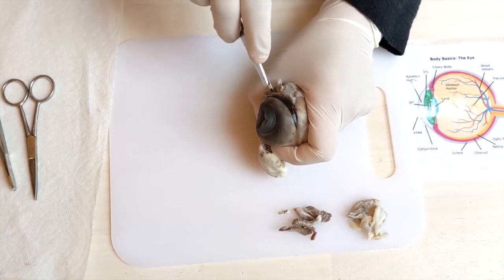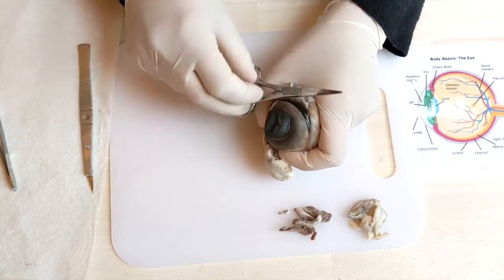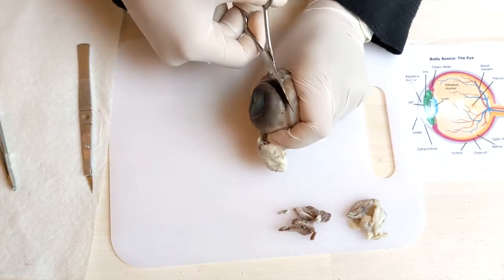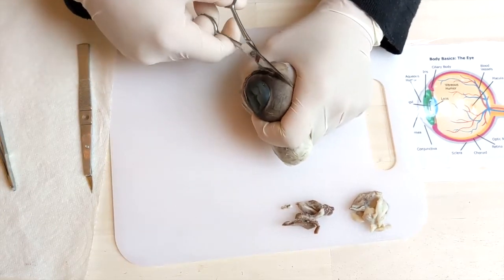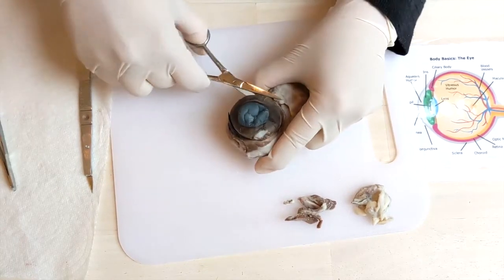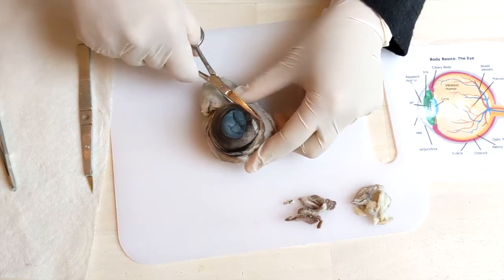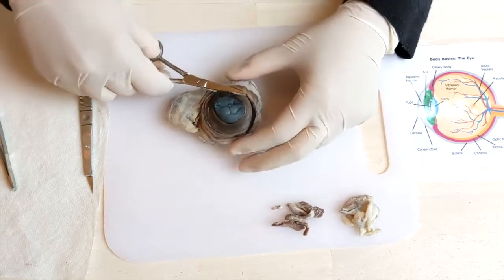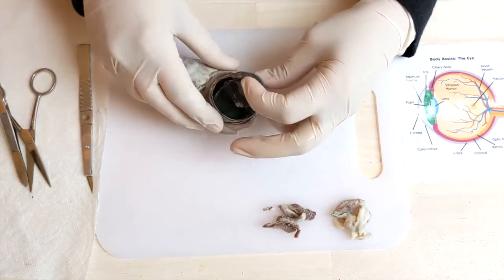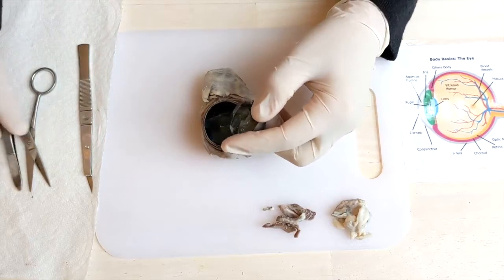What is that water squirting down? It looks like water. Maybe it's aqueous humor. We'll learn about that. So we'll put the scissors here, and then we're just going to keep cutting all around it, like this. We're cutting it open. Let's find out what's inside. I feel like there's going to be a bucket of water in there. Or not actually. Wow, it's like Jello. It's very jelly. I thought it would be water.